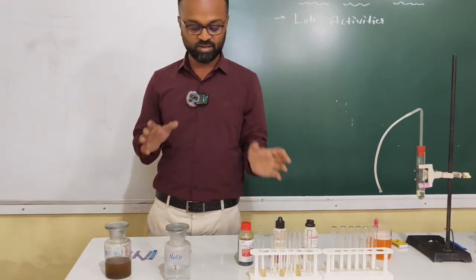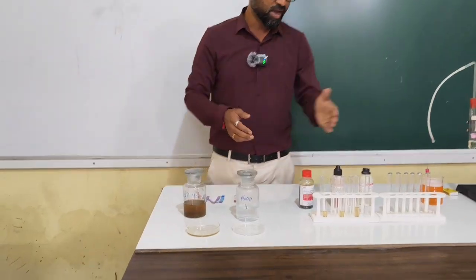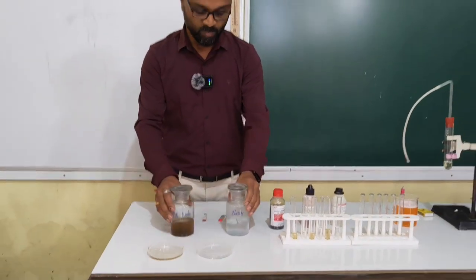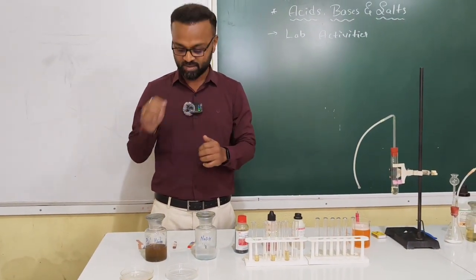We are going to test the solutions given here. Some solutions are in a petri dish, and some are in test tubes, as you can see. We are going to test the nature of the solution, whether it is acidic or basic.